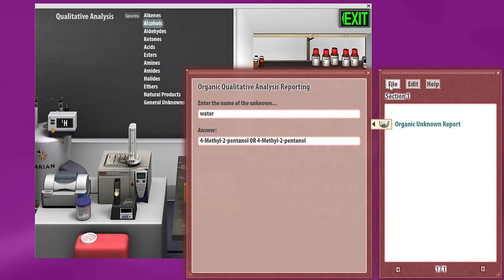They could then save this file and send it to you, and then you can open it up and see what they guessed and what it actually was for these unnumbered unknowns. So that's the way you can use those.